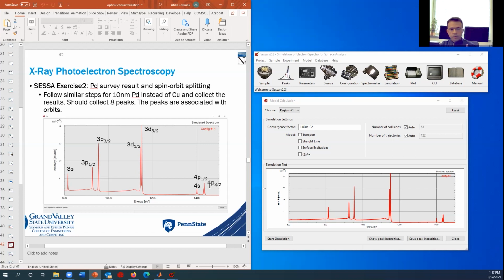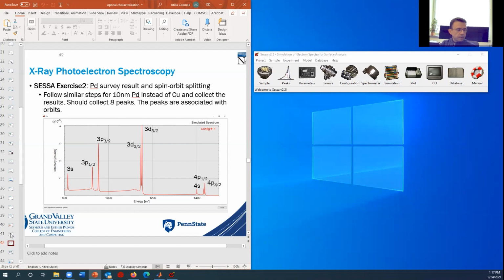So in a more advanced discussion, you can talk about that in your classroom too, that you can see the 3/2 and 1/2 at the same time here. Right, so they're probably corresponding to these two in here. Yeah, those two little peaks there. I don't know if you can see it with my mouse, the name is given here, and the energy level is also given in here. All right, so what else can we do?